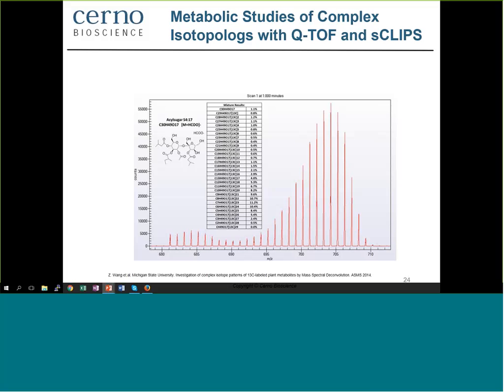We can look at the chemistry and metabolics here, and the problem, of course, is that the C13 is incorporated into these metabolites at a lot of different sites and a lot of different amounts, and to quantitate them, of course, is quite difficult. And again, because there's only one proton difference, all the peaks tend to overlie on top of each other.